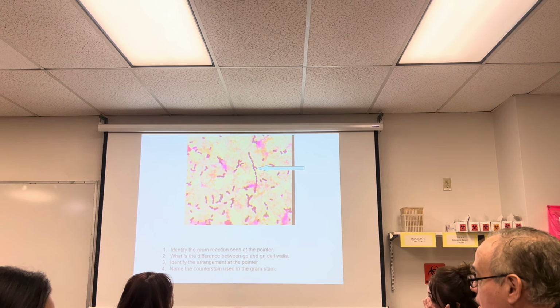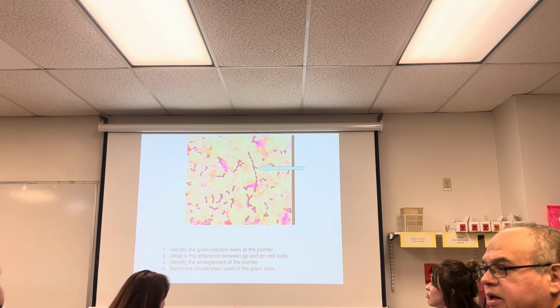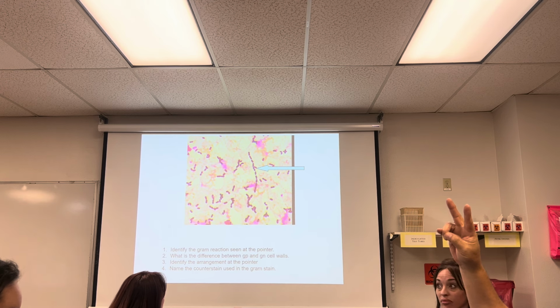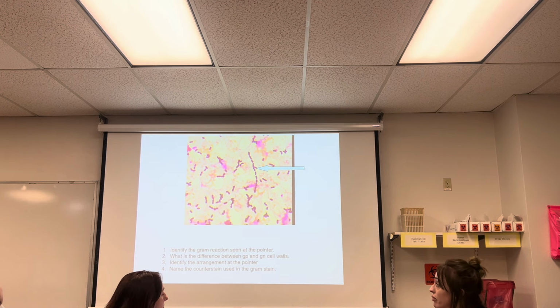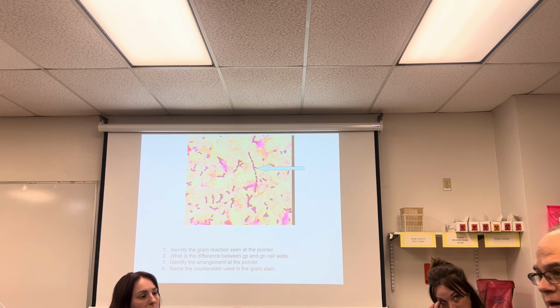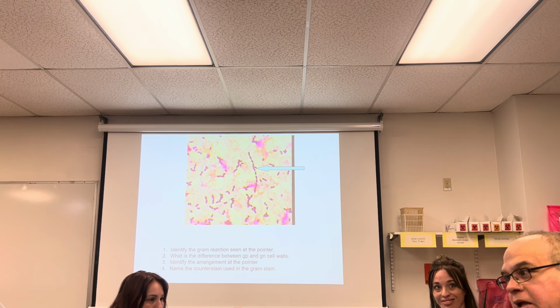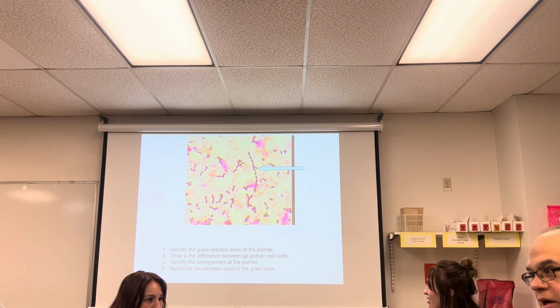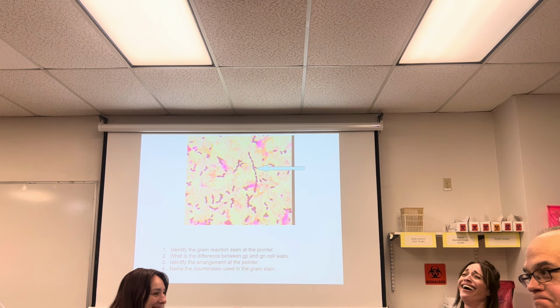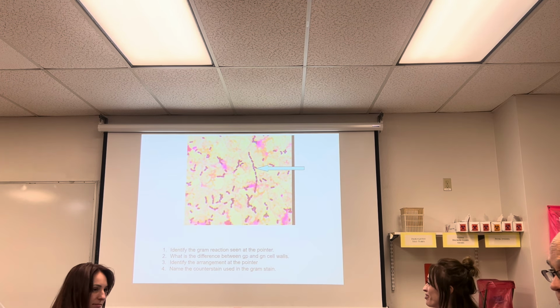Okay? Name the counter stain used in the gram stain. The counter stain is the second stain. Safranin. I don't count off for spelling, but if you mean safranin and you spell it saffron, that's something completely different. Saffron is a spice. So words have meaning. Okay?